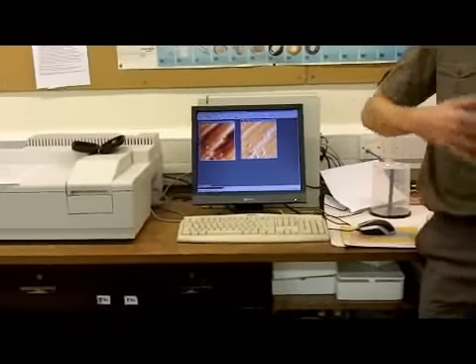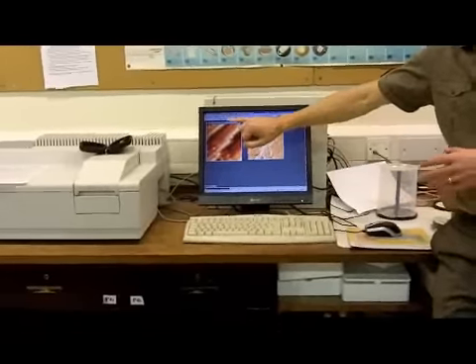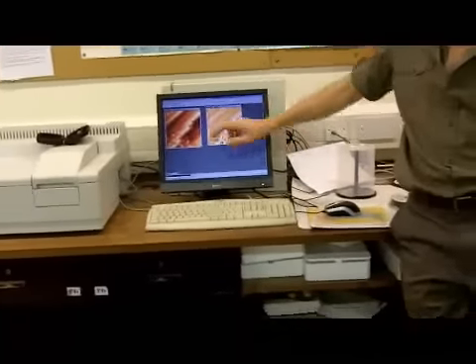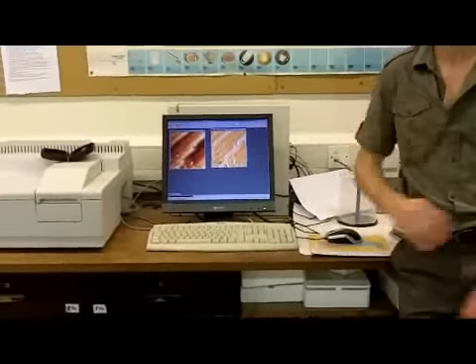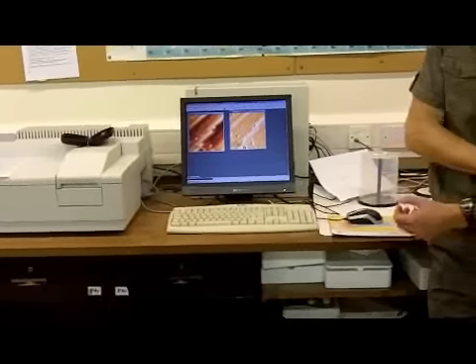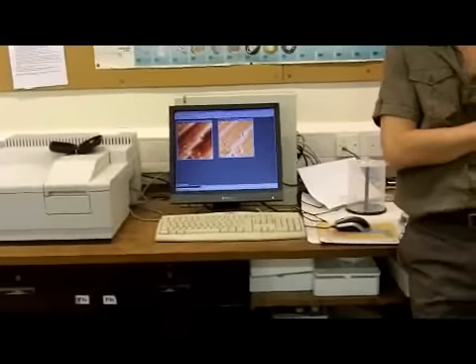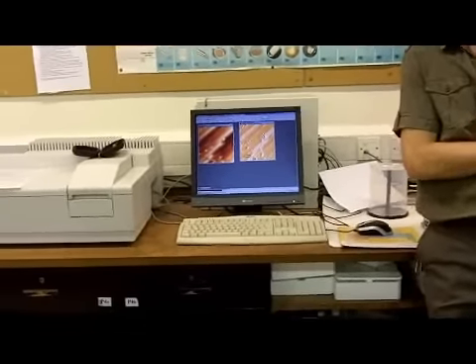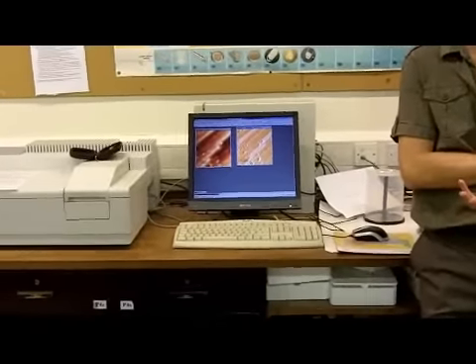Now, in fact, this Z image is almost as good as the current image, so in a way this isn't a good example. We're probably going to use everything on the Z image. Okay, so there's your image of the surface. Now you need a few tools to help you analyze it. And the first one you're going to want to use is to measure distances and heights.